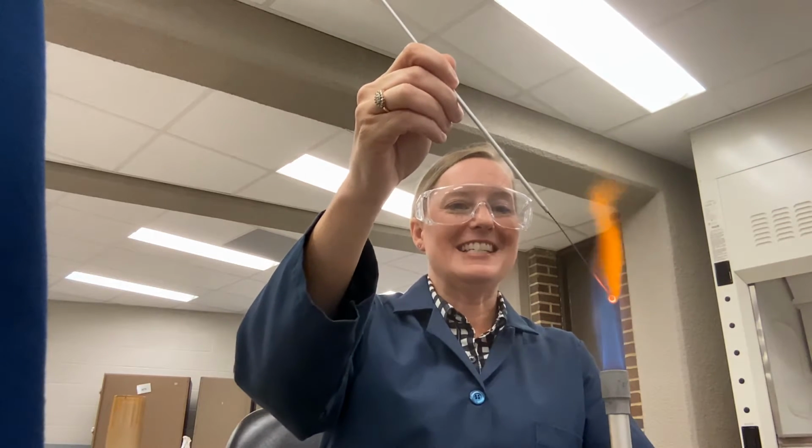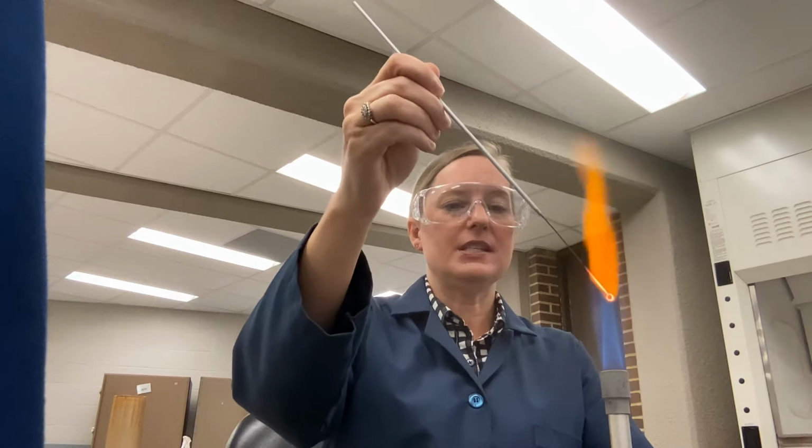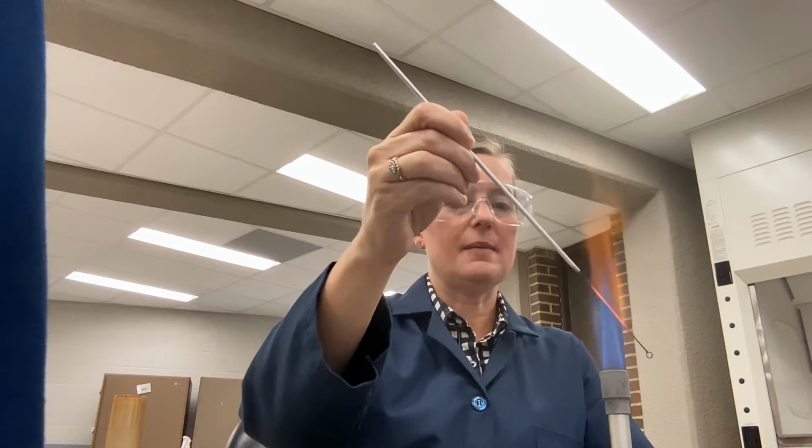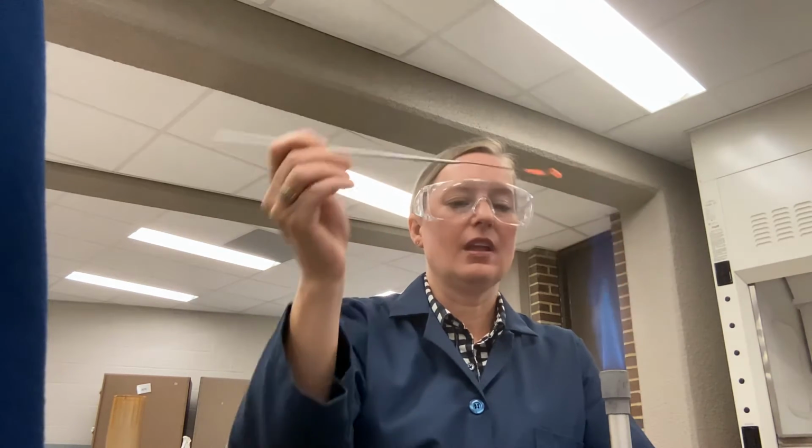We're going to put the entire loop from the tip all the way down to the braided portion through the flame until it gets nice and orange and hot. The hottest portion of the flame is the blue cone, and we want to make sure the entire part gets flamed so that it is all aseptic and contaminant free. Then we need to let it cool for a moment. If we were to go right into the broth, we would hear a sizzling sound, which is bad for 2 reasons. 1, because it releases bacterial aerosols into the air, and 2, it kills what we're trying to grow.